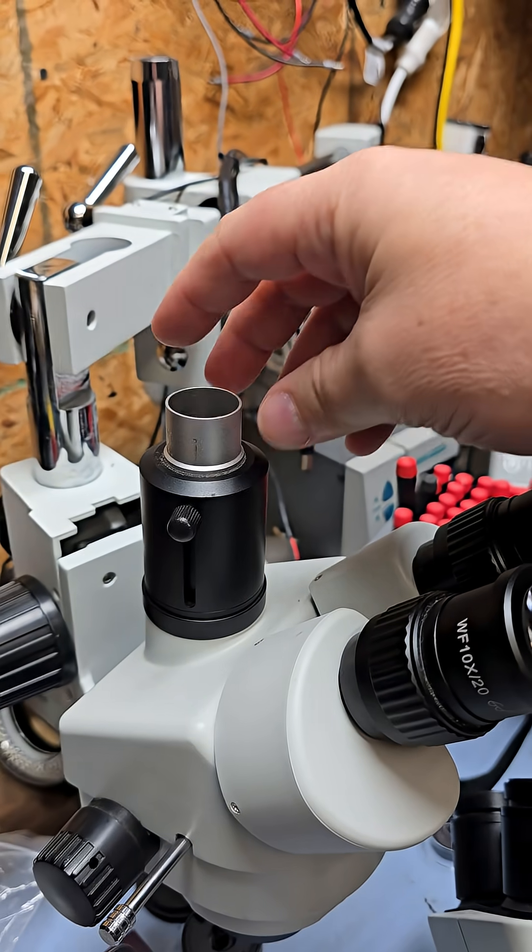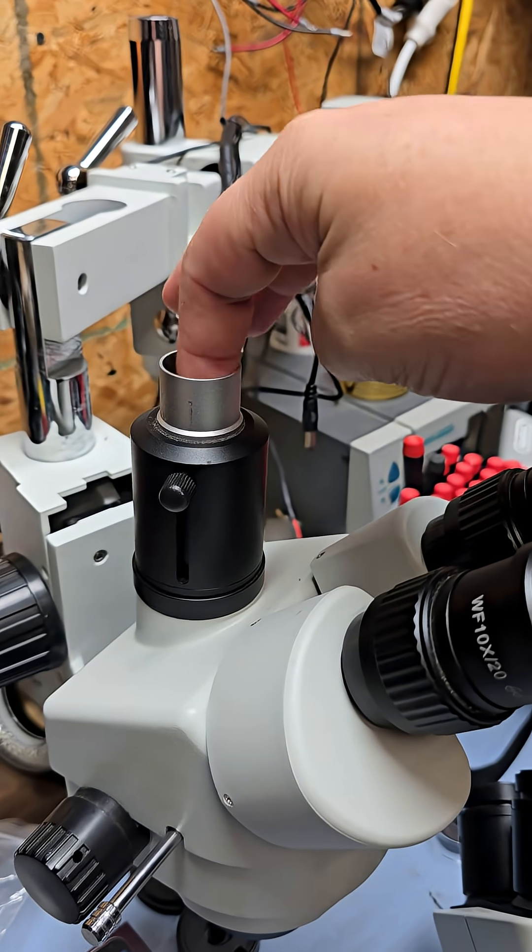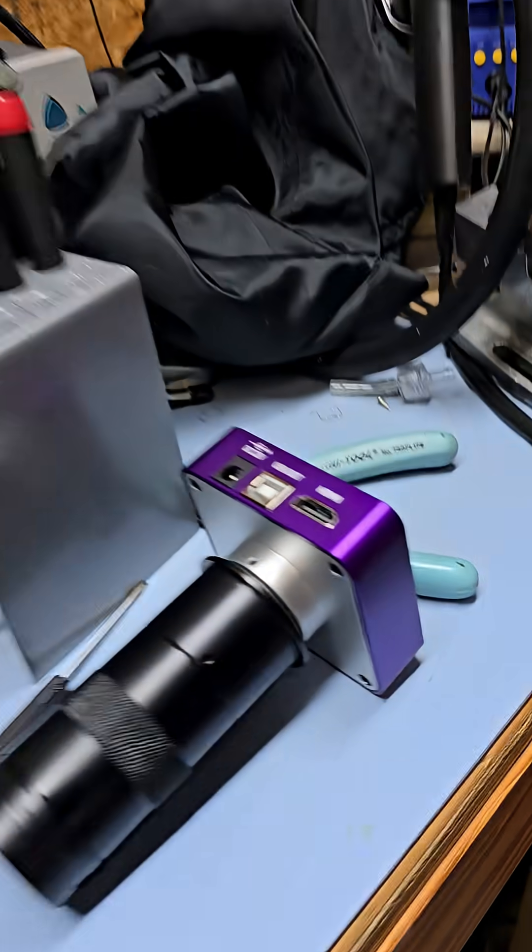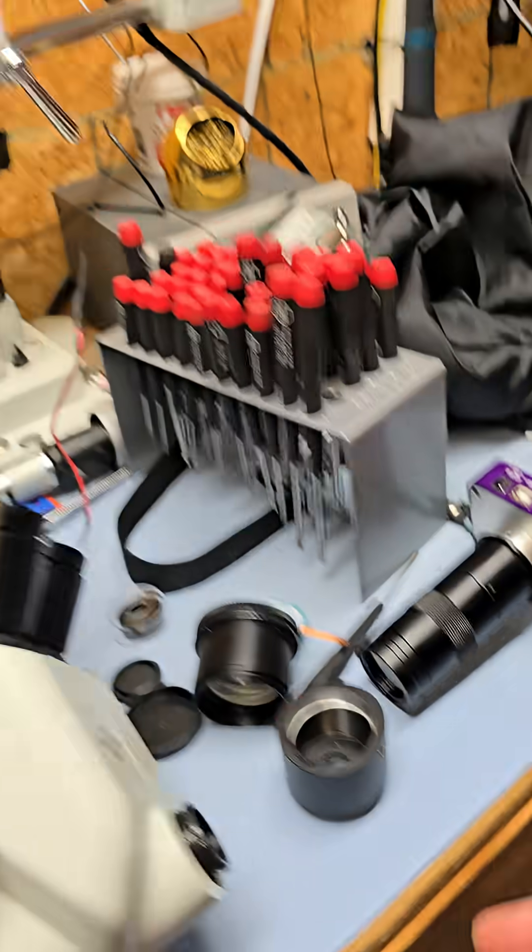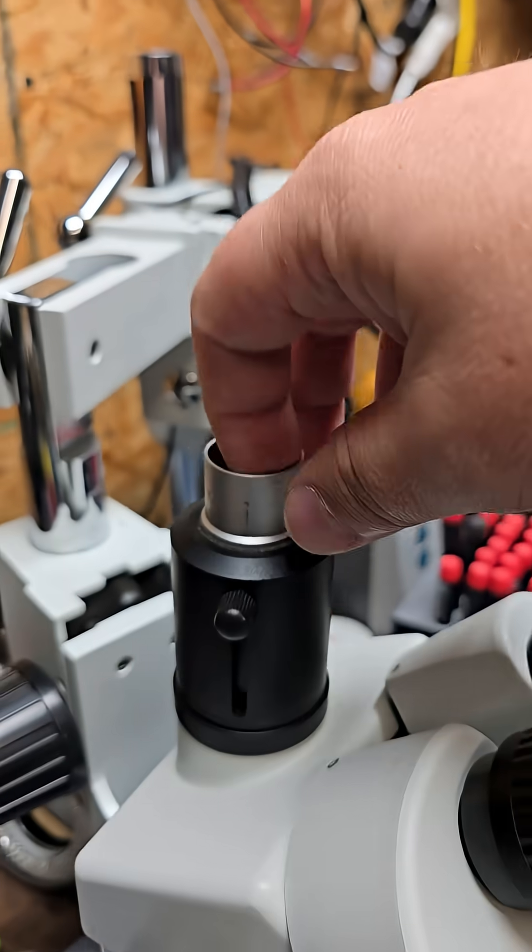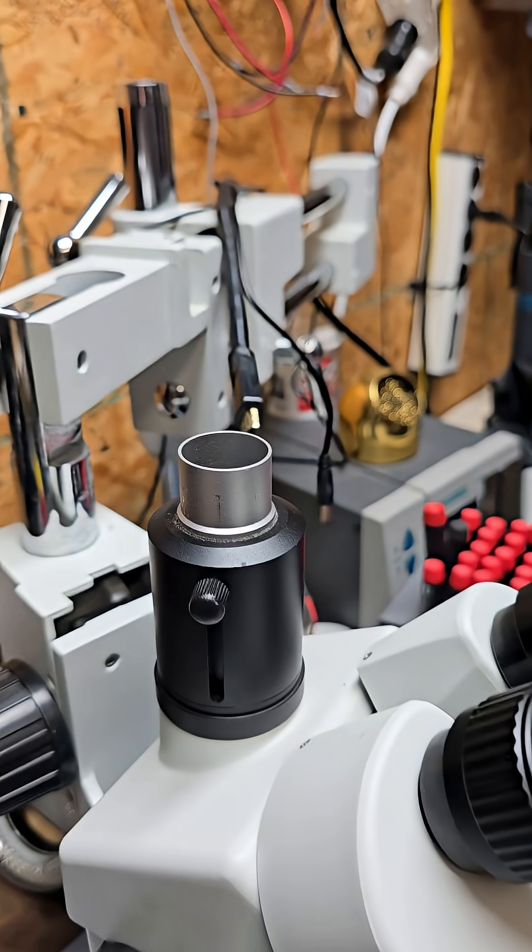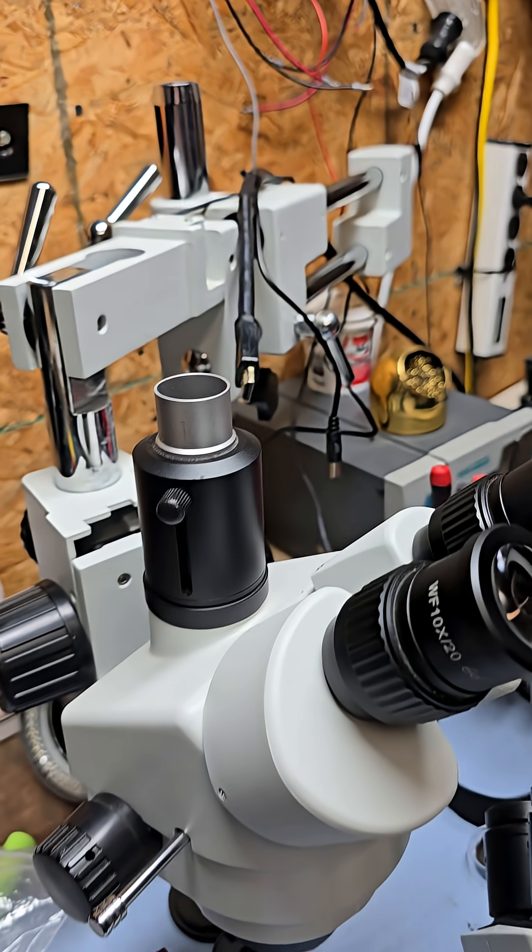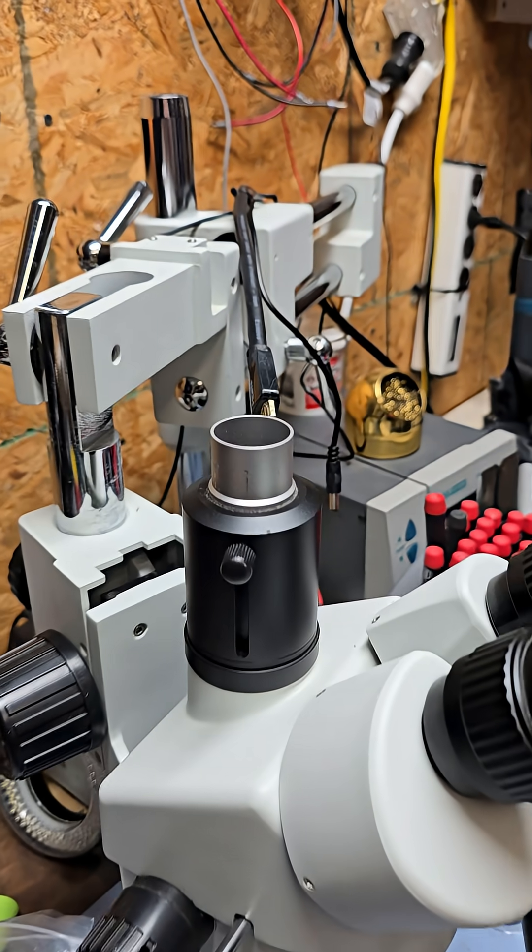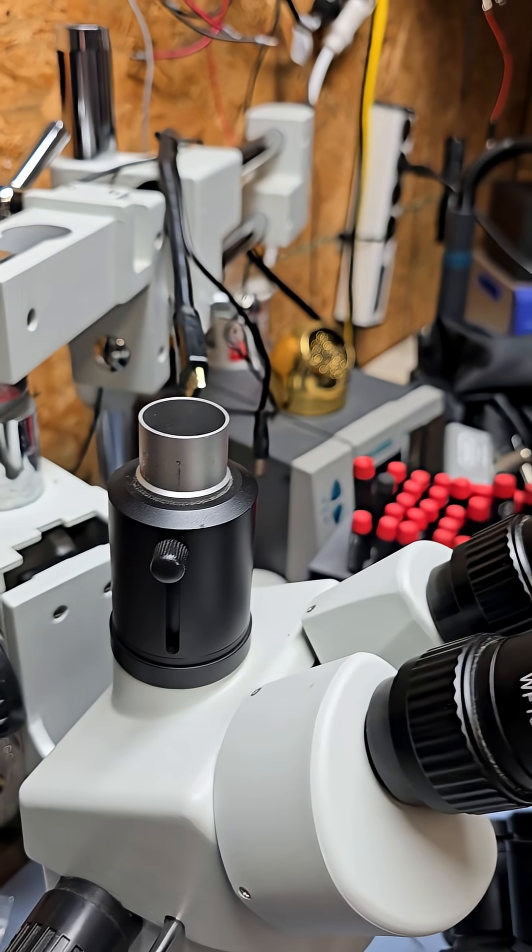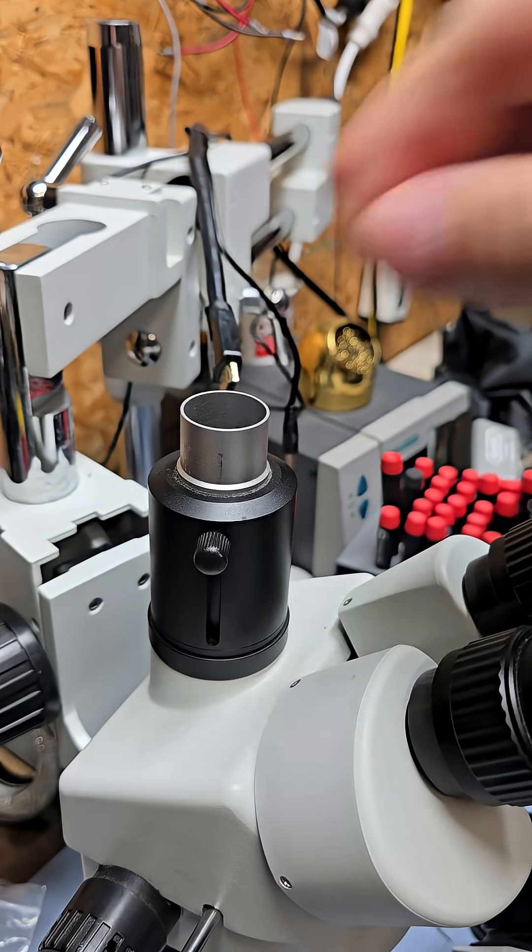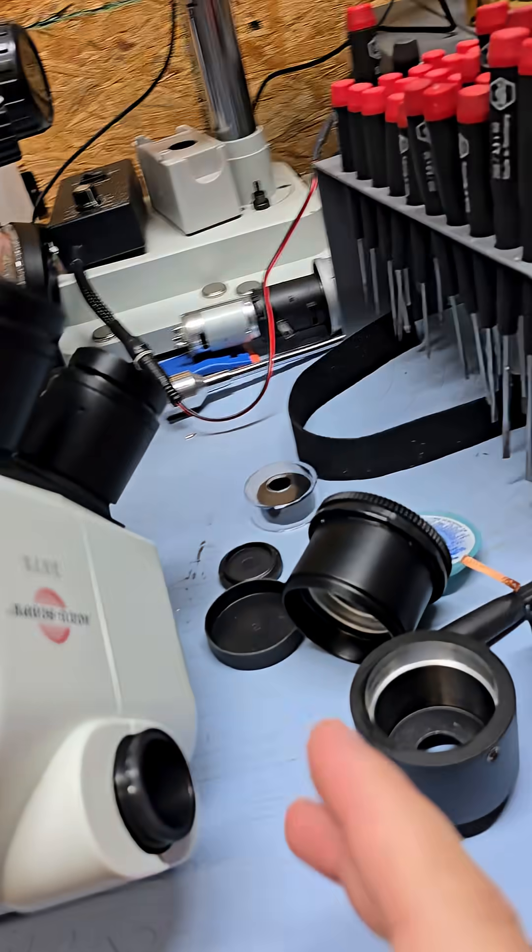I'm so frustrated at this point because you can see like even this adapter right here, it's not threaded. So of course that won't fit the camera. It has to fit AmScope cameras, which are six, seven hundred dollars. And then they're just junky USB-C cameras that are only like a hundred bucks really. So they mark them up five, six hundred percent. It's so frustrating.